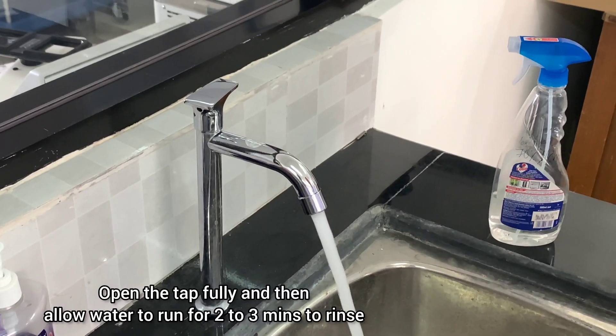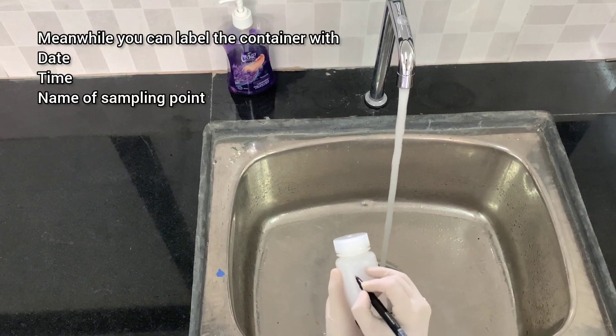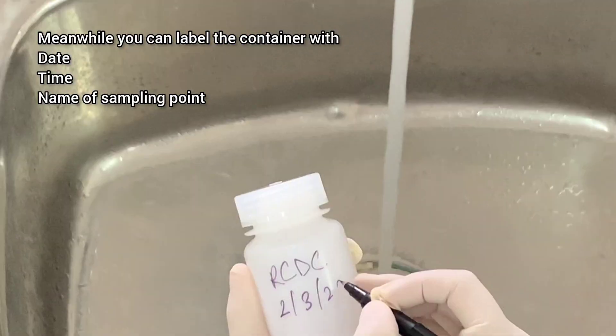Open the tap fully and then allow water to run for 2-3 minutes to rinse. Meanwhile, you can label the container with date, time, and name of sampling point.